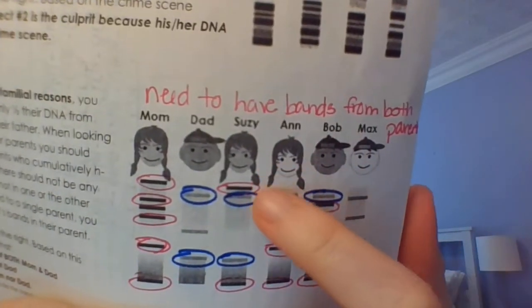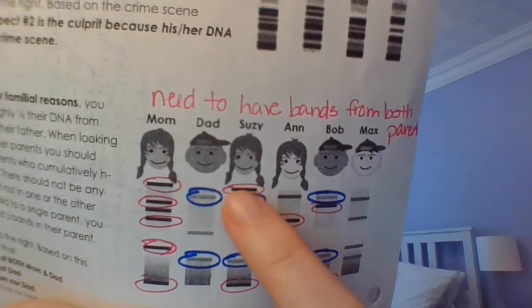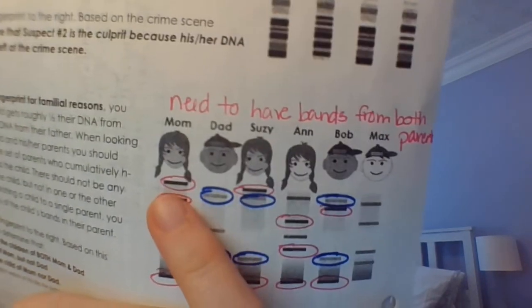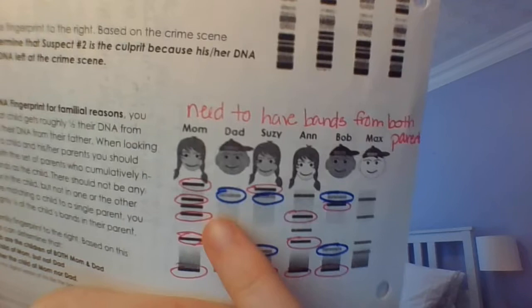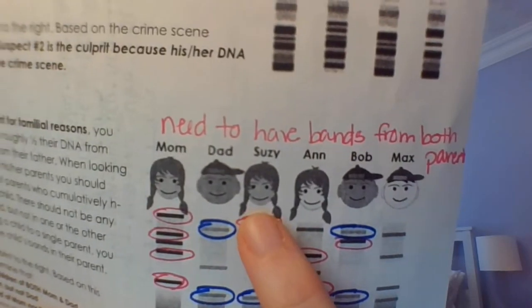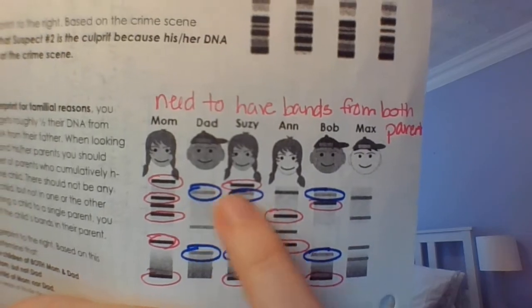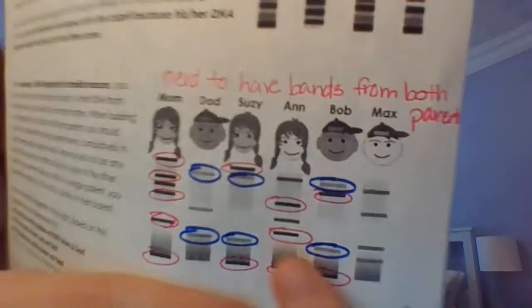Okay, so Susie's first band would be right here. We see that mom has a band right there as well, so that doesn't really tell us that the dad's eliminated yet. Susie's second band is right here. The dad has a band right there, so we would say that that's a match.